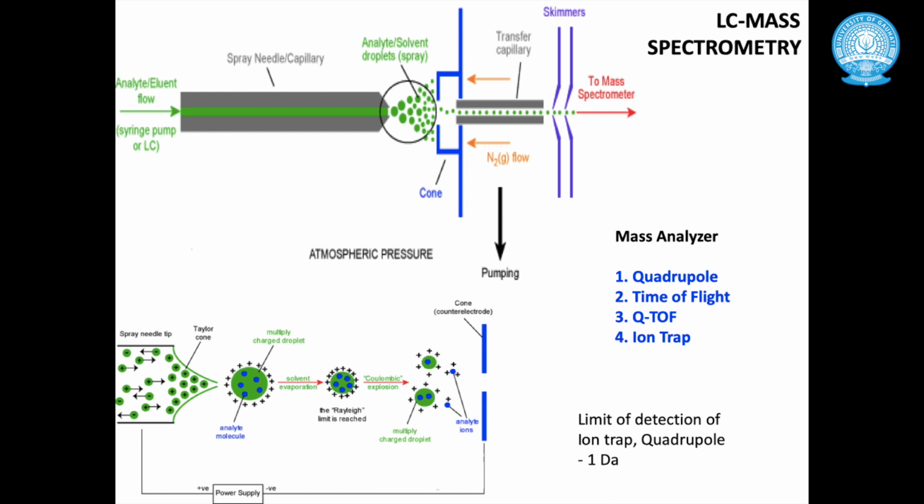Based on our partial characterization, we have arrived at this product ion whose mass may be 449.